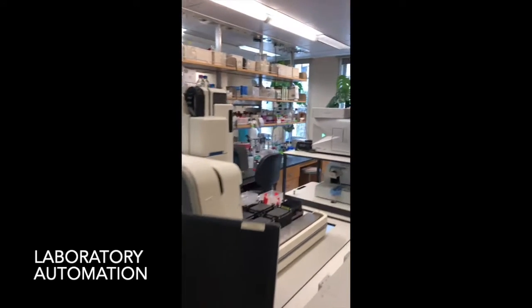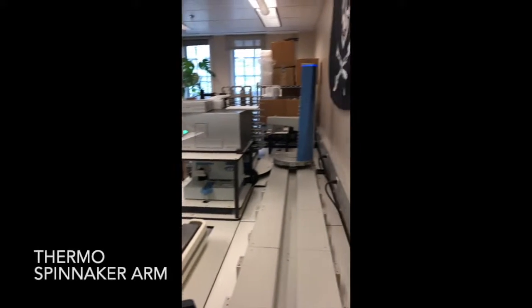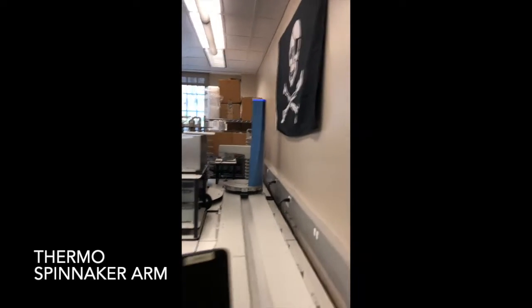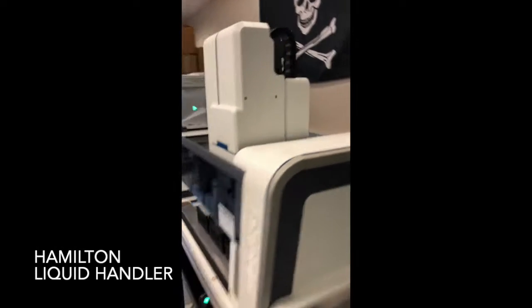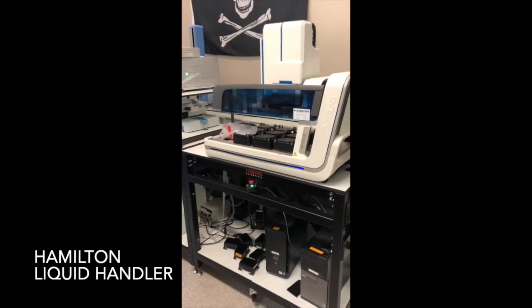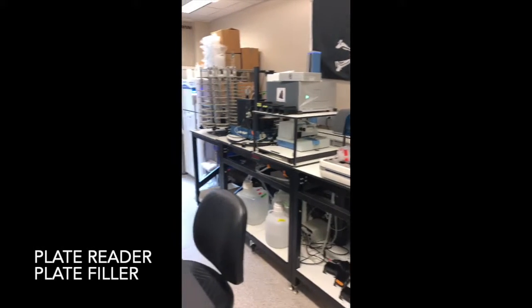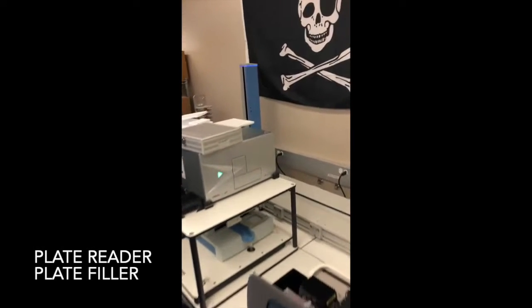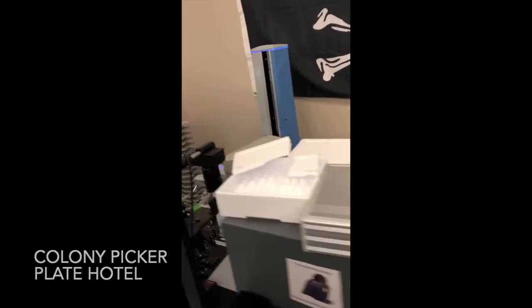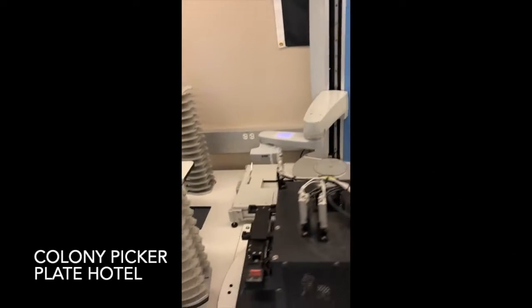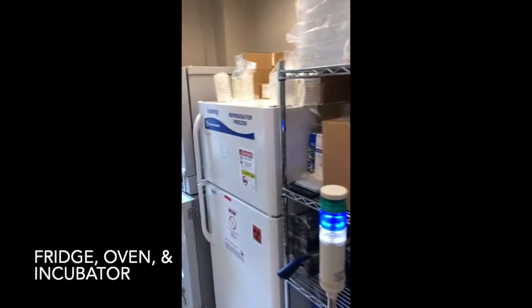This is a little unlike something you'll find in most labs. So we have a significant amount of automation. Here we have a thermospinnaker arm to move plates back and forth between several instruments, including a Hamilton liquid handler. We have a plate reader. We have a plate filler. We're going to zoom quickly past our colony picker there. And you see plate hotels to hold lots of plates.